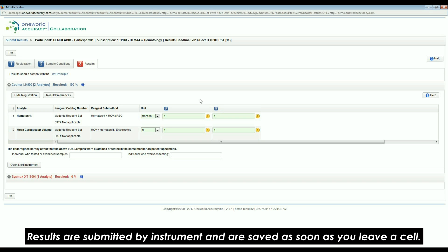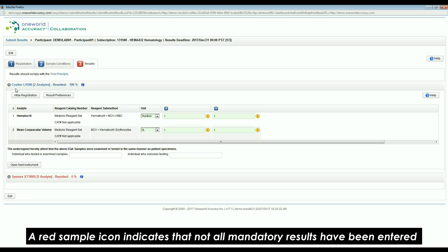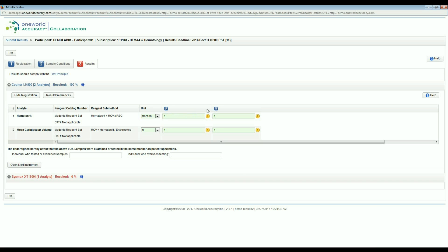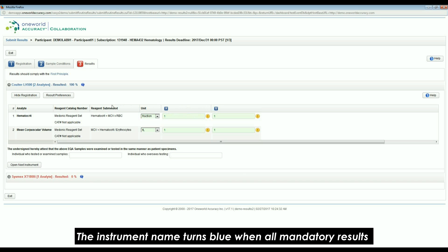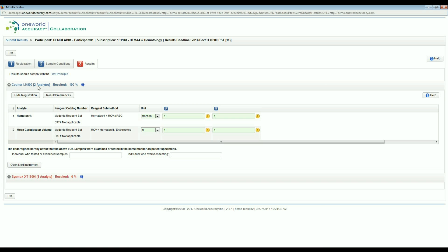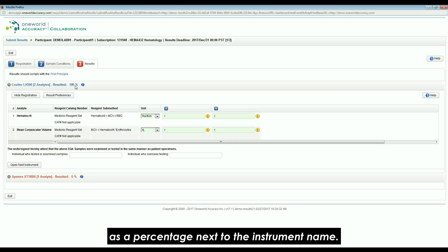Enter the results for each analyte and sample by directly typing in the respective cells for quantitatively reported analytes, or select the correct response from the drop-down menu for qualitatively reported analytes. Results are submitted by instrument and are saved as soon as you leave a cell. A red sample icon indicates that not all mandatory results have been entered. Once they are added, the sample icon turns blue. The instrument name turns blue when all mandatory results have been entered for that instrument.